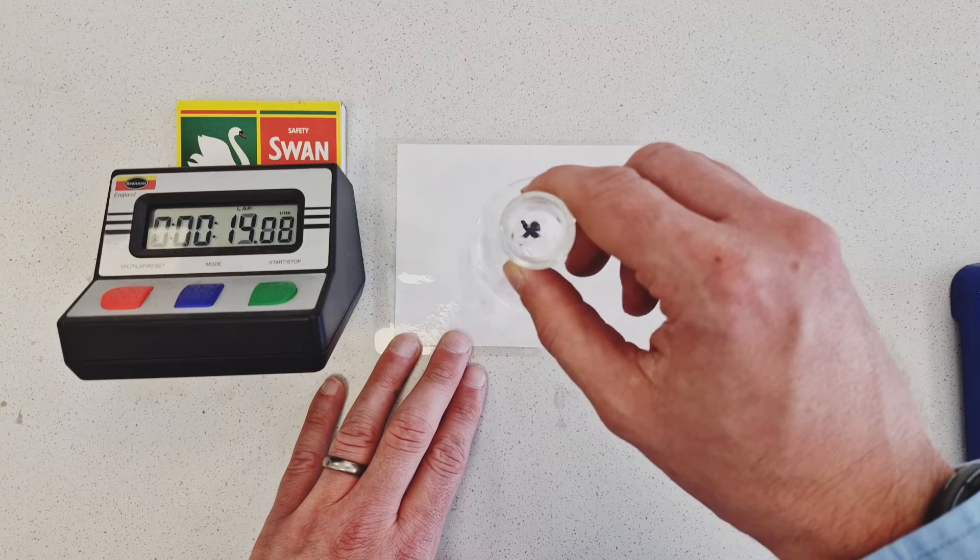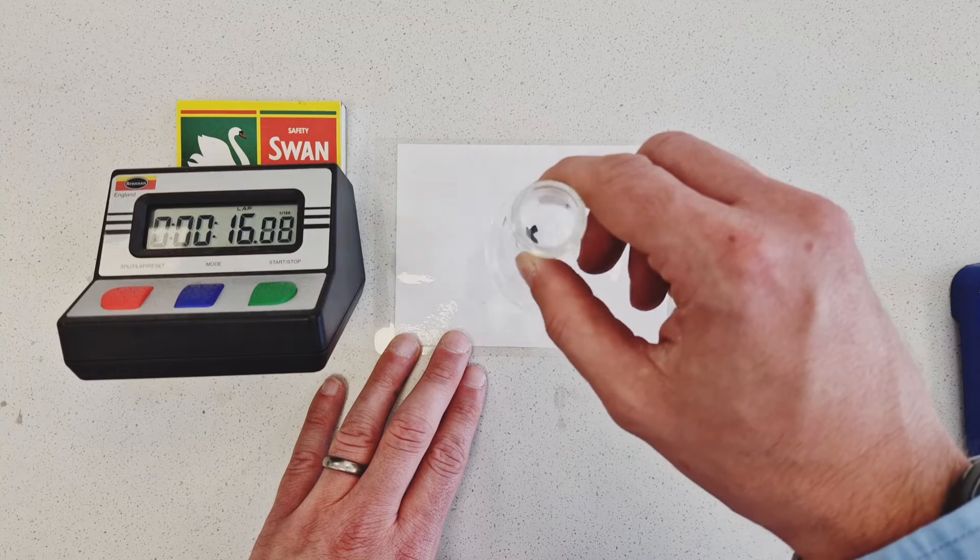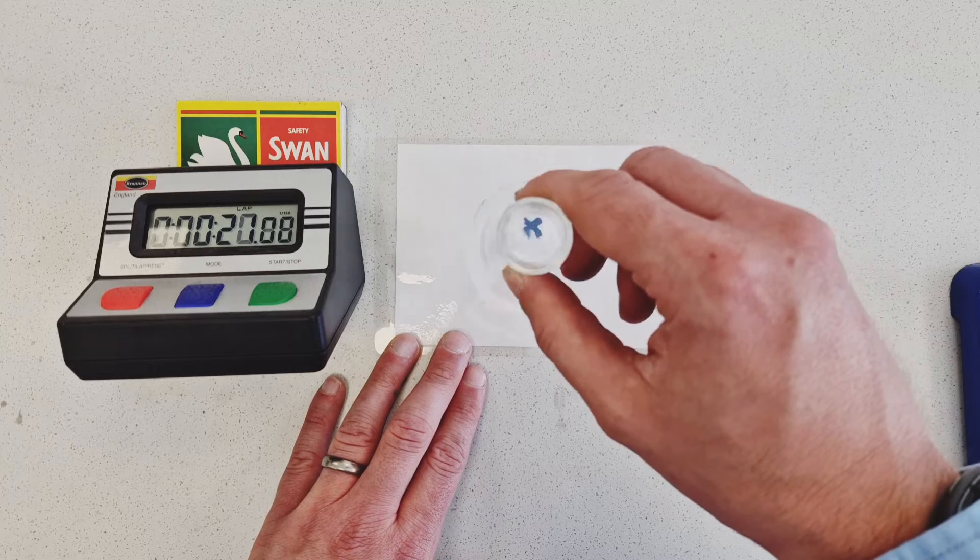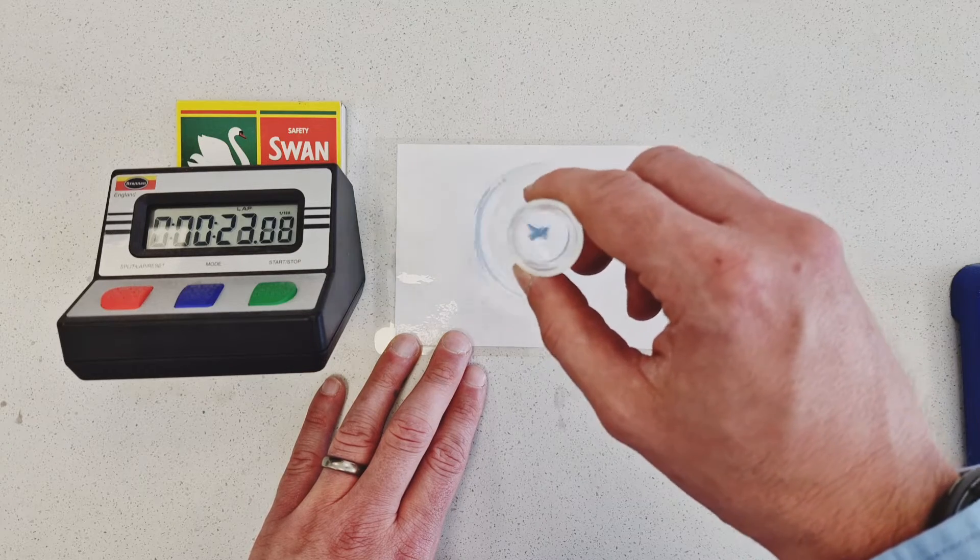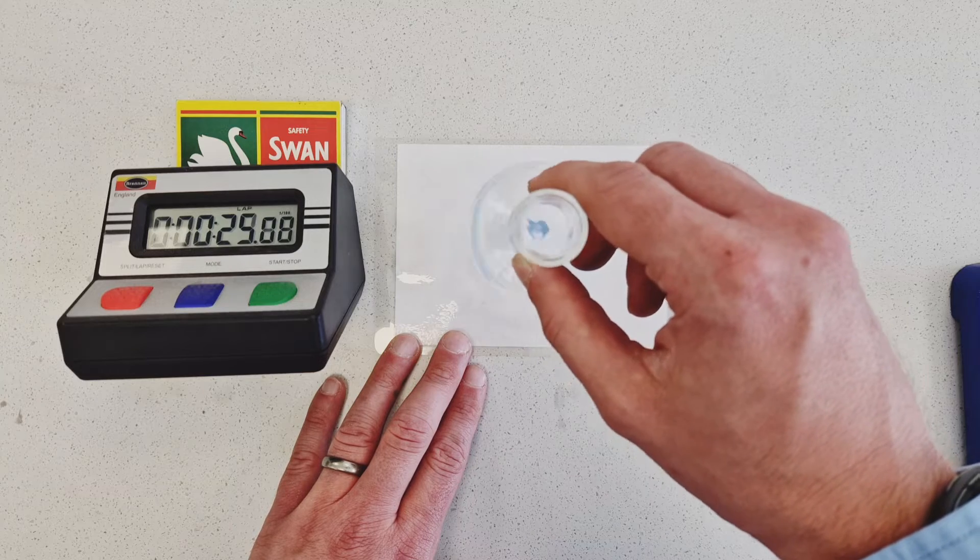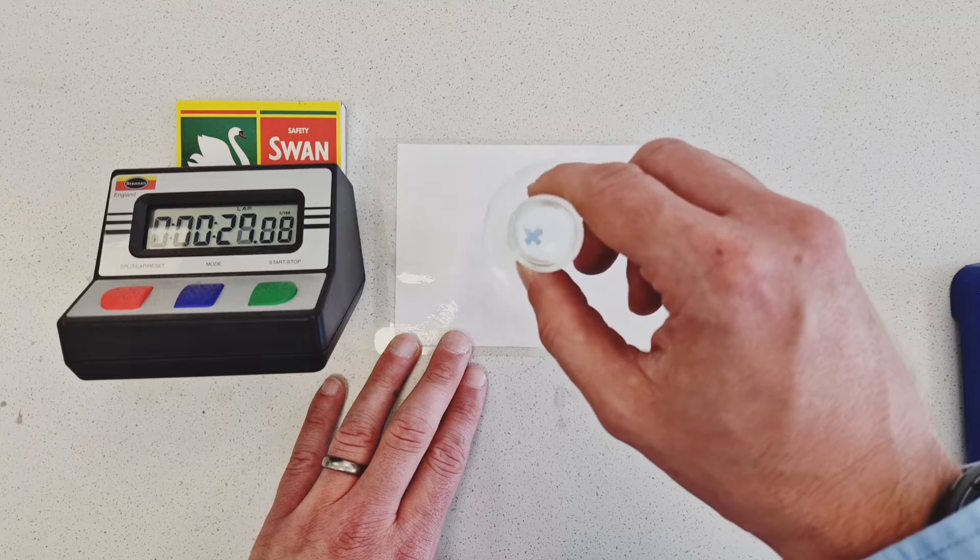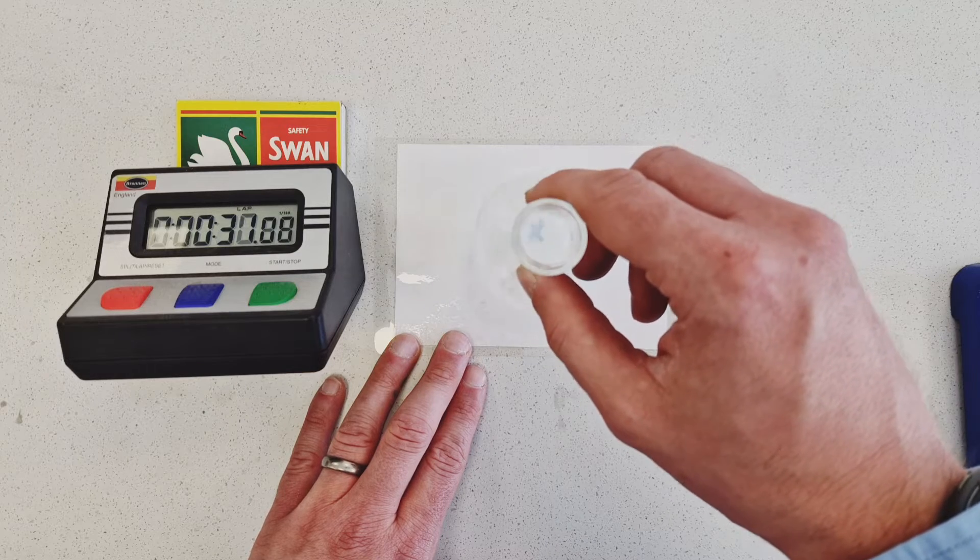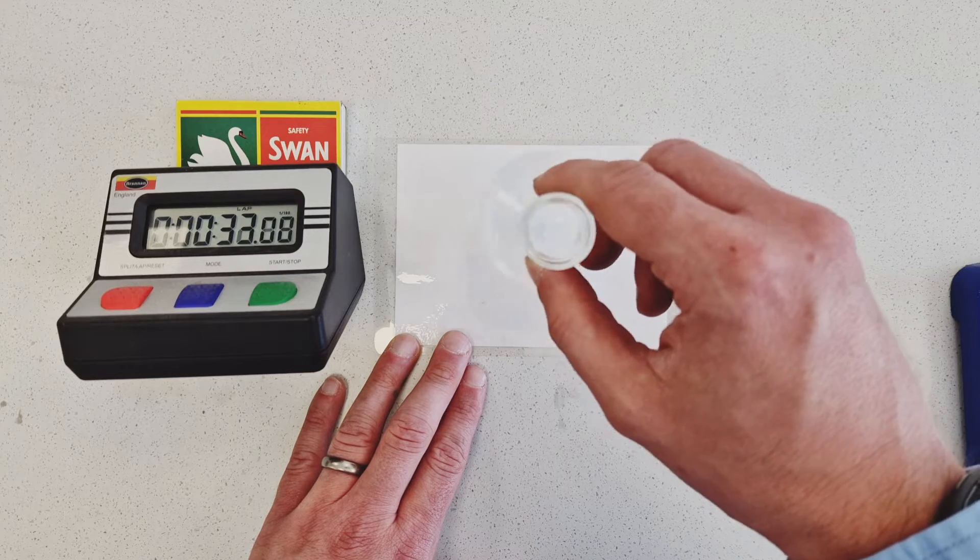This will mean that over time, slowly but surely, the cross will disappear from view as that cloudy suspension is formed. And so we make sure our eye is positioned above the cross looking down through the suspension and we wait until that moment when the cross becomes invisible to stop the stopwatch and this will give us an indication of the rate of the reaction.